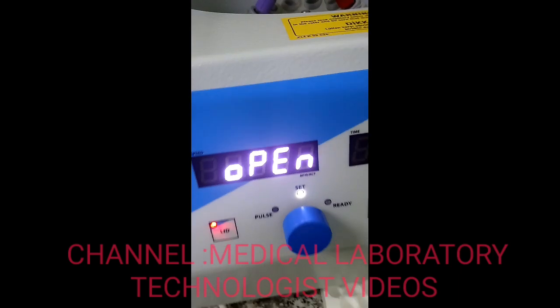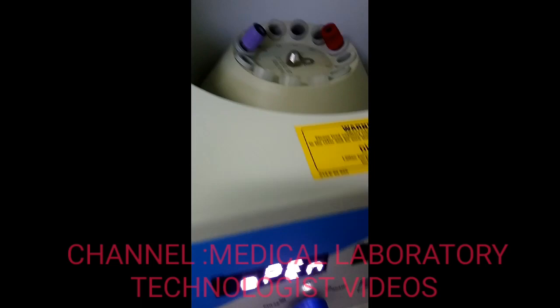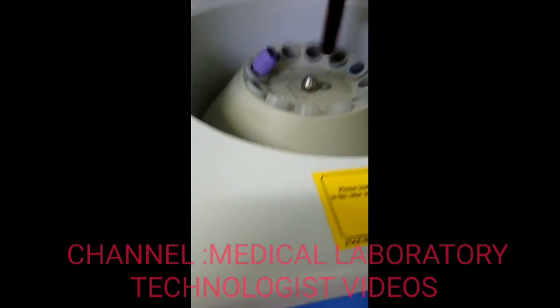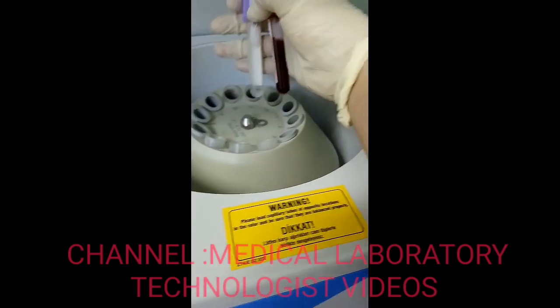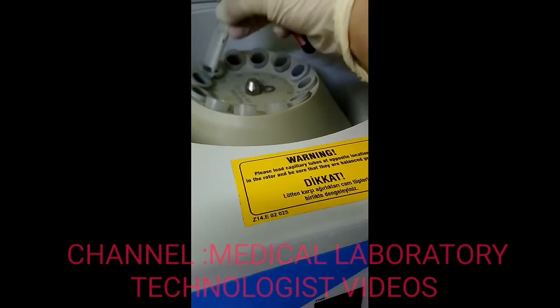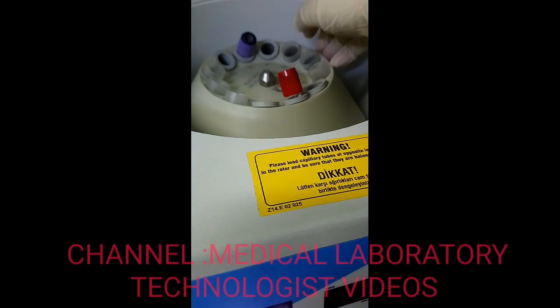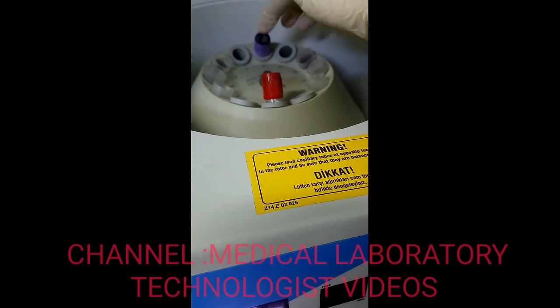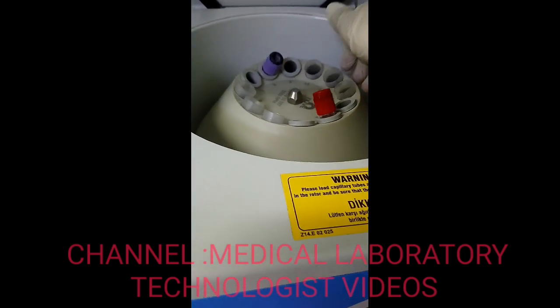You can use both RPM and RCF depending on your requirement. Now I want to centrifuge my sample. I will place one tube and balance it with another of the same level in the opposite position. Always remember to keep samples in opposite positions with the same balance — only then will you get good centrifugation.